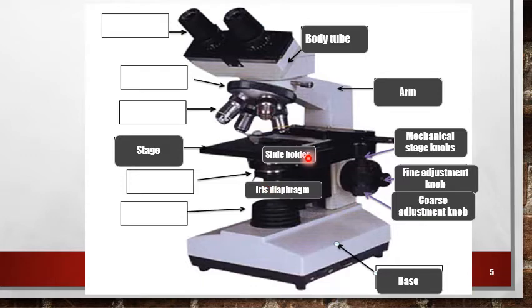Slide holder or clips are used for fixing of the object on the stage.